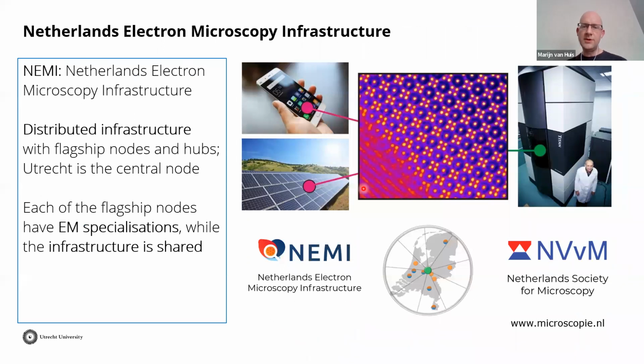We are part of NEMI, so that is also what this top microscope is from. It's a €5 million investment from the national roadmap. NEMI is the consortium, and there are flagship nodes where really development takes place, including Utrecht, and there are user nodes, but we all share the same infrastructure.